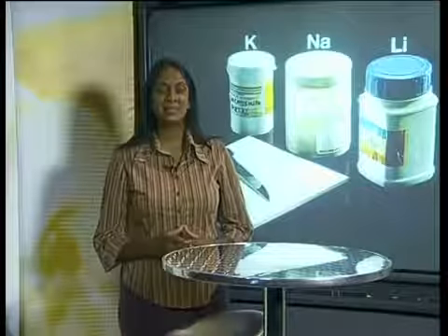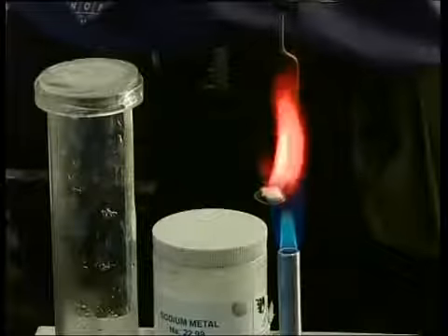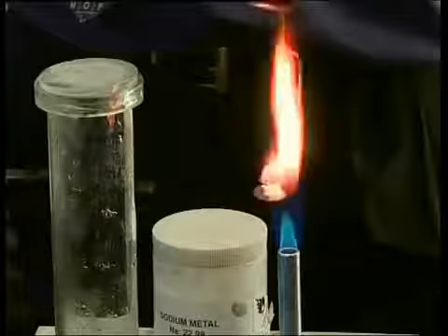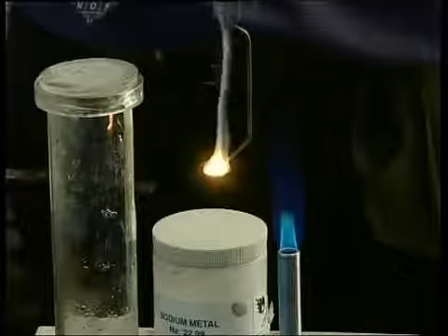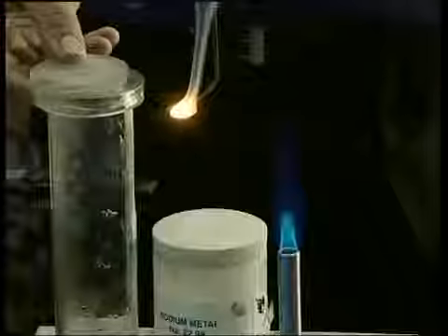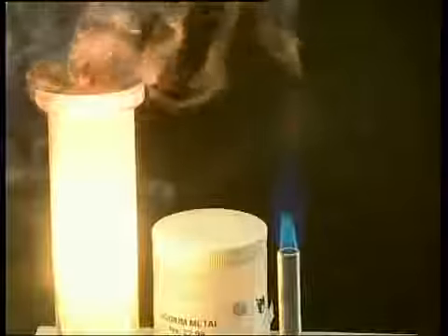This is the experimental procedure that needs to be followed. A gas jar is filled with pure oxygen and sealed temporarily. The cut piece of metal is placed in a combustion spoon. The metal and oxygen are the reactants in this experiment. It is gently heated in the flame of a Bunsen burner for a few moments until the metal is burning, and then the metal is plunged into the gas jar full of oxygen. The new substance formed in this reaction is called the product.